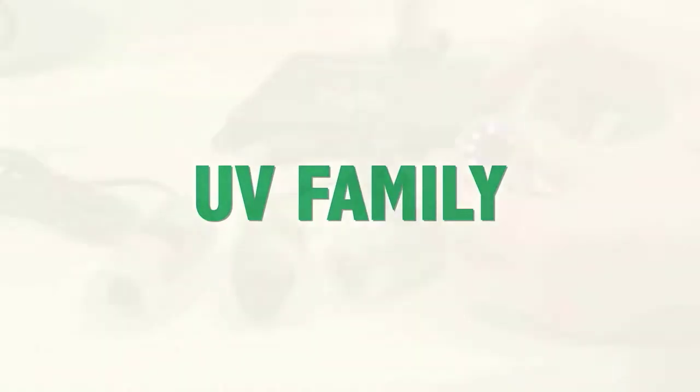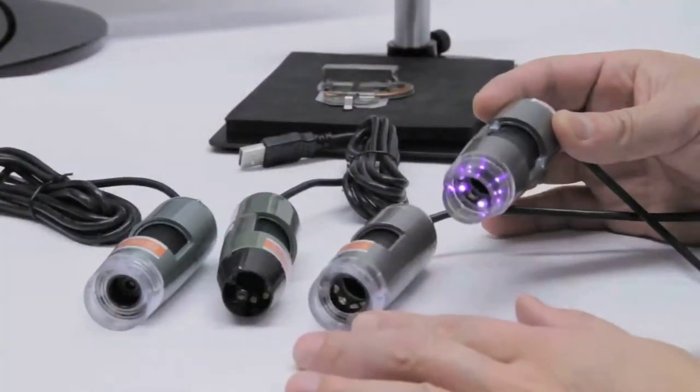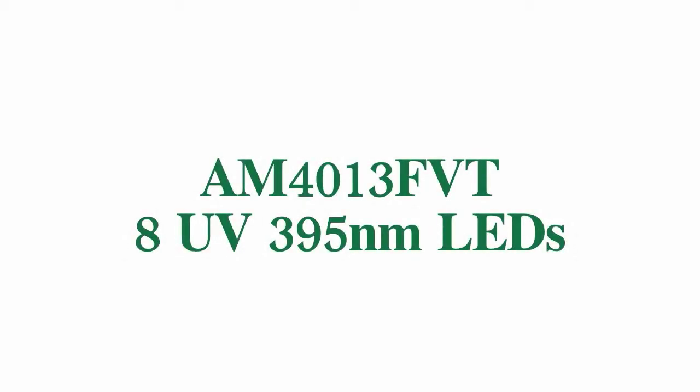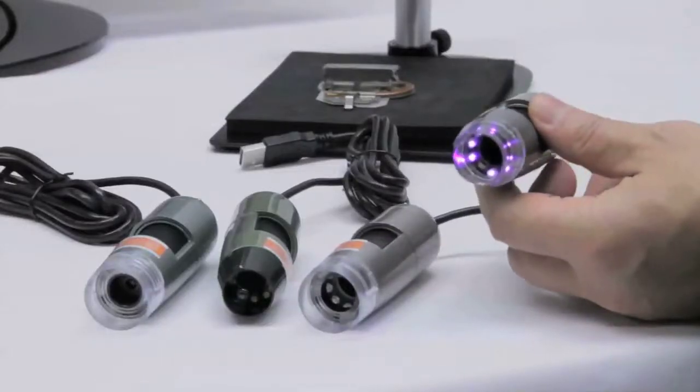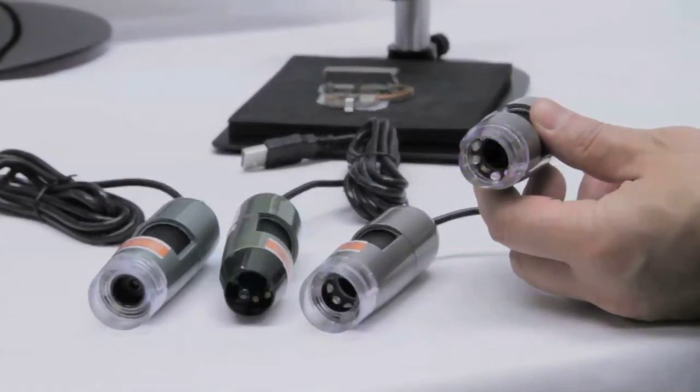Introducing the UV family. In this family we have four different models. First we'll start out with the AM4013FVT. This has eight UV LED lights and they are tuned at 395 nanometer wavelength.